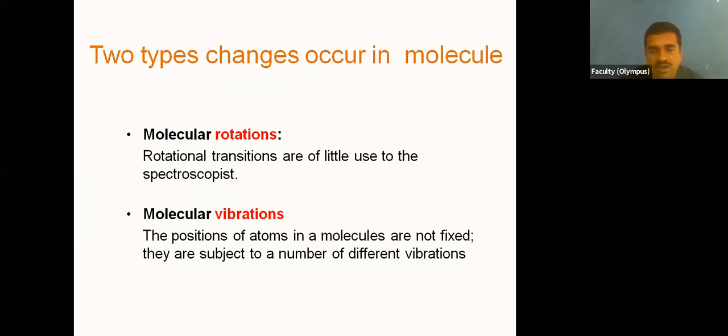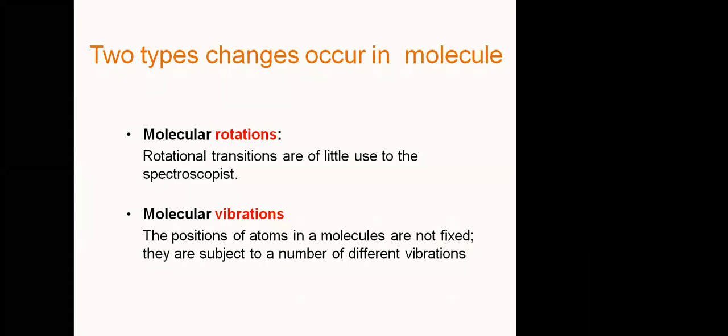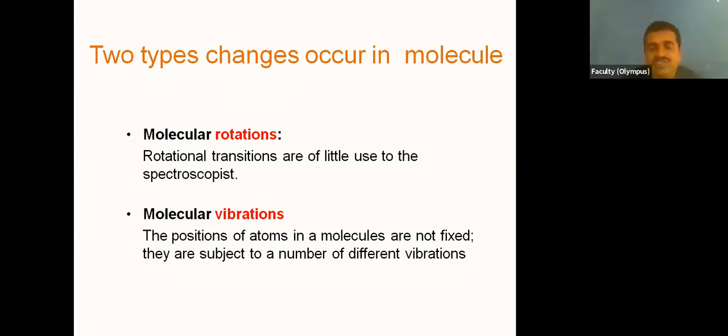And there are a number of vibrations. Different modes of vibration are there. Because of these vibrations, the molecule has some energy. We call it vibrational energy.